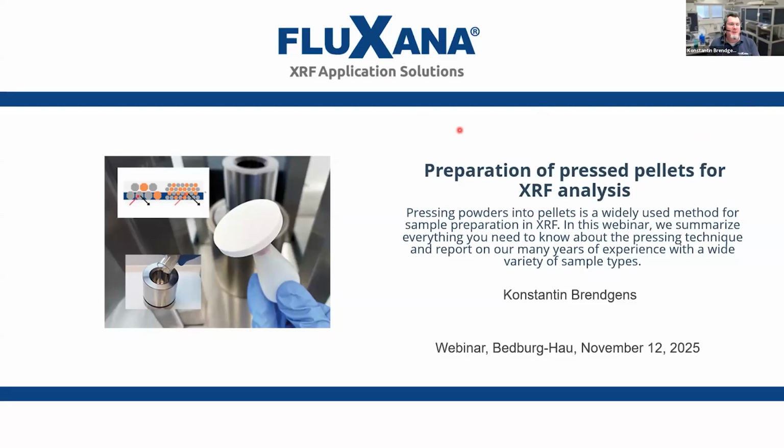Today's topic is pressed pellets. We'll talk about the techniques used and their application to your analytical task, and we'll go over some examples on how we utilize it here in FLUXANA in our laboratory.